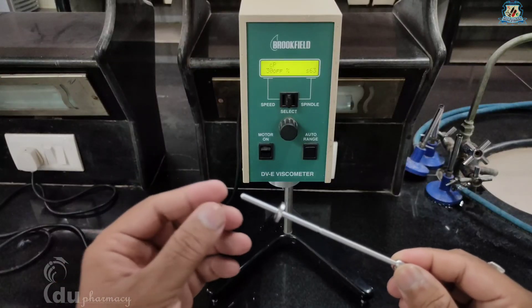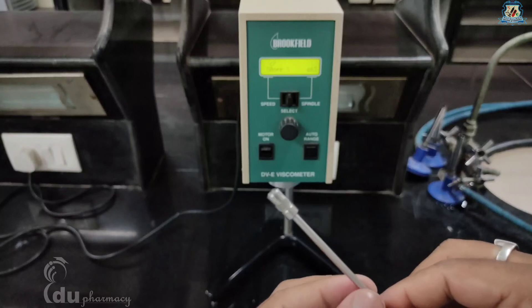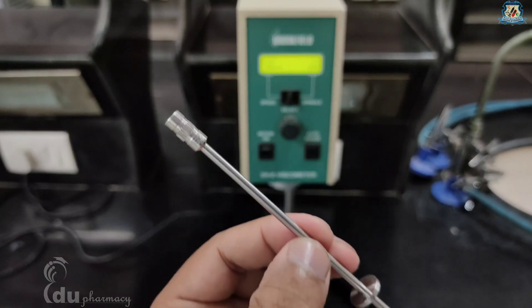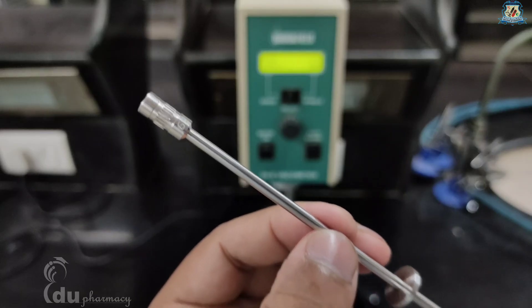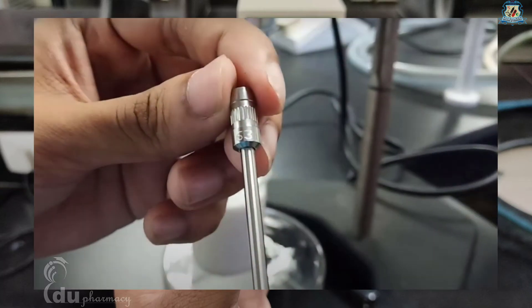Next is spindle selection. A spindle is a stainless steel bob which is an important part of this instrument. There are many types of spindles provided with the instrument; this model comes with a set of four spindles. You can start with a spindle of any size — the selection is totally on a trial and error basis, and you can always make adjustments according to the sample and viscosity readings. Spindles can be identified by the number provided on the side of the spindle coupling nut.